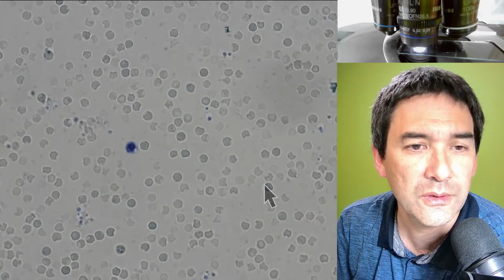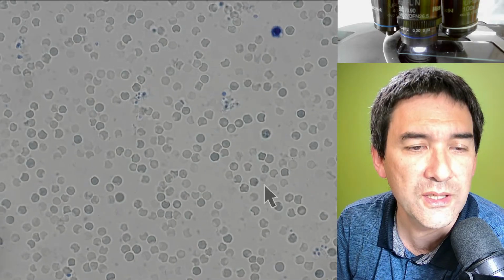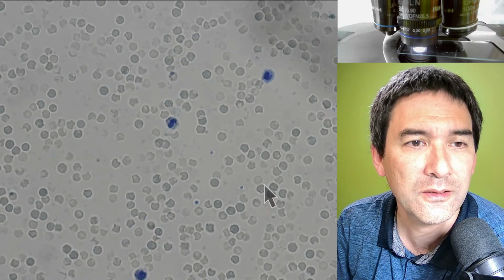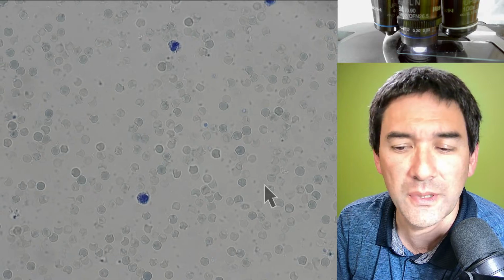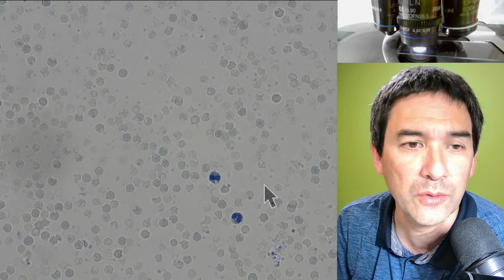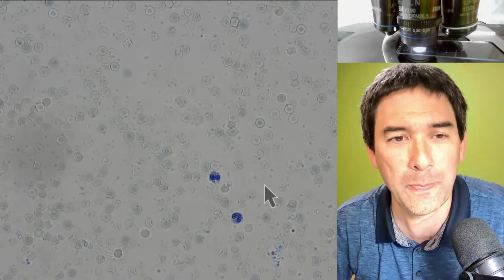Many of the red blood cells, you see that they have basically completely lost their shape. Here again. What I would like to do as well is to also try the staining now with the ink. I don't know if this is going to work, but here, that's actually one of those that I kind of wanted to see.